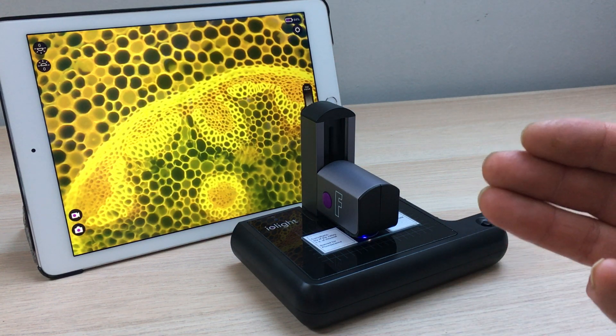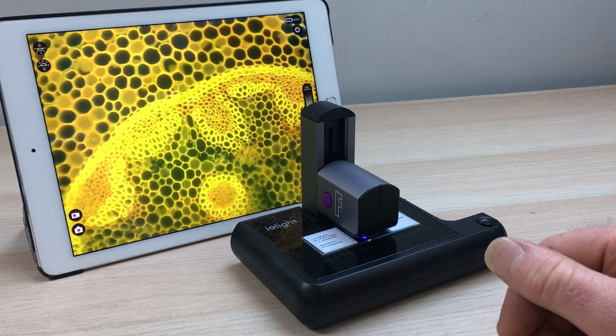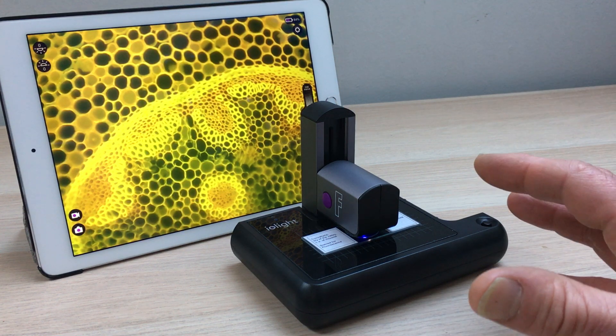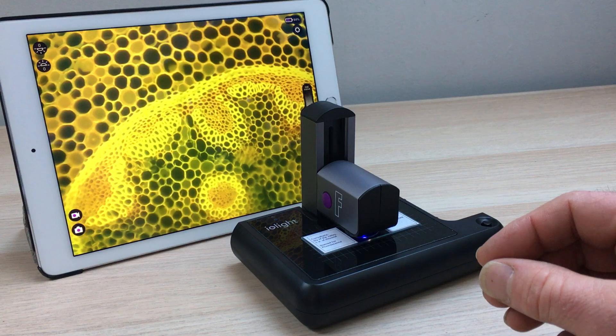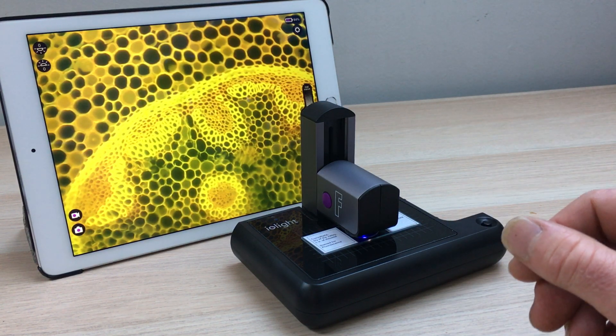Things like GFP, YFP, and DS-RED. We think this is an ideal tool for sorting and characterisation of samples and other routine fluorescence microscopy, and of course education and outreach.